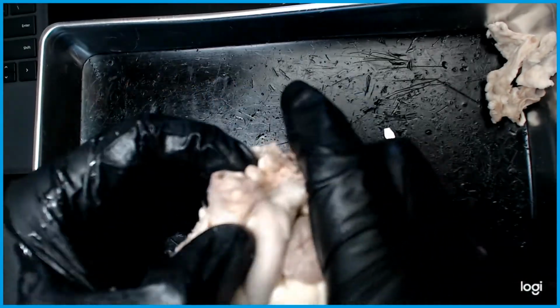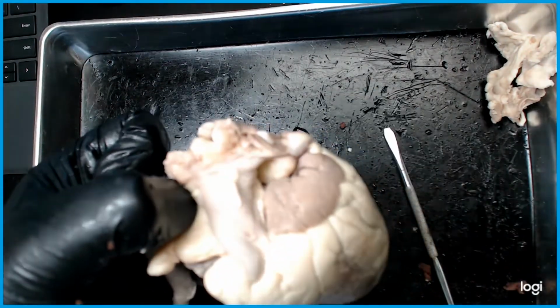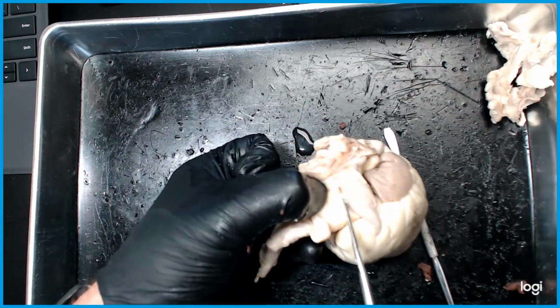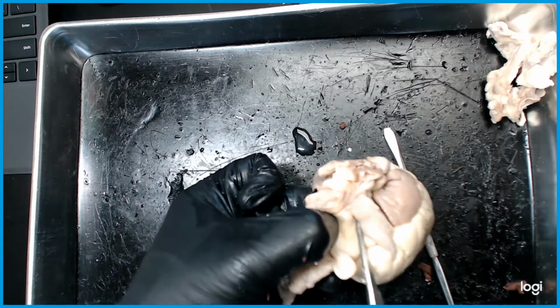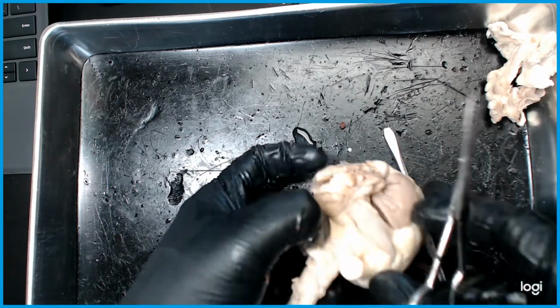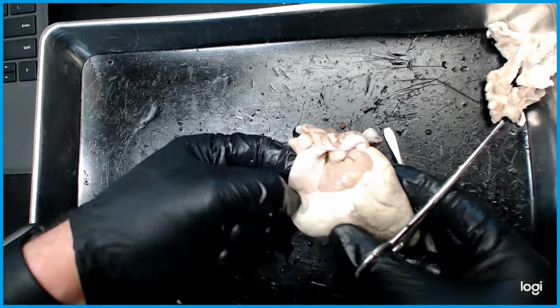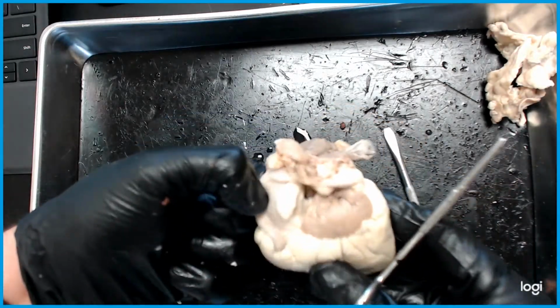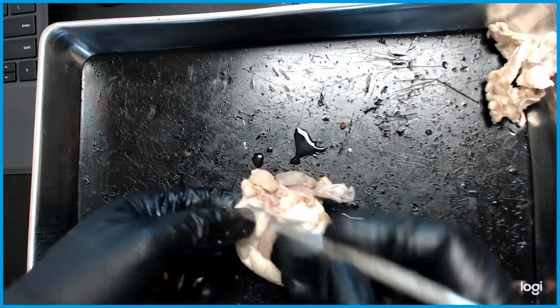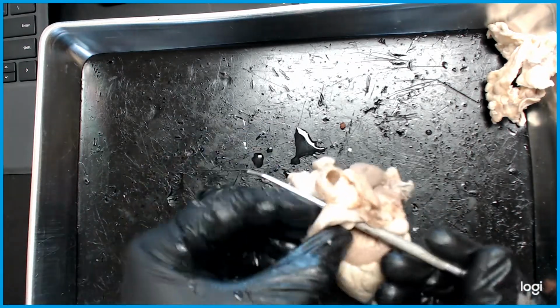So what I want to do now is continue and expose it. Now that I know where it is and I'm able to identify it, let's go ahead and separate that. All I'm doing is removing this connective tissue. Yeah, it's a little too much light, right? It's going to reduce the light. So if you see, my finger comes out there. If I don't want to poke my finger, I can just use the probe. There's the probe, and it helps me separate some of this tissue.